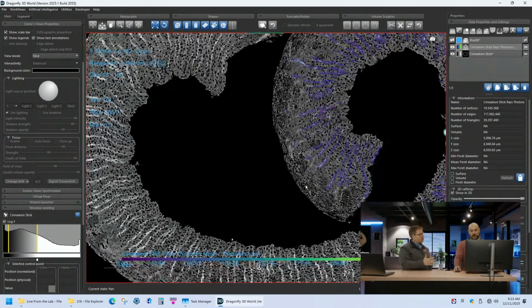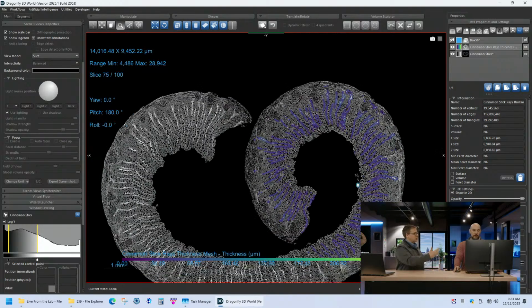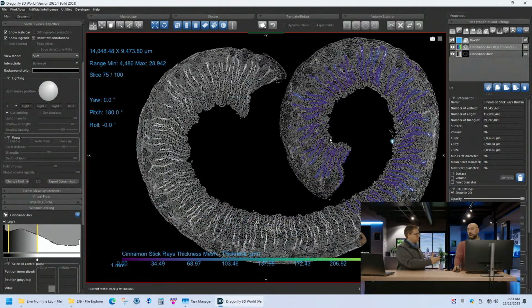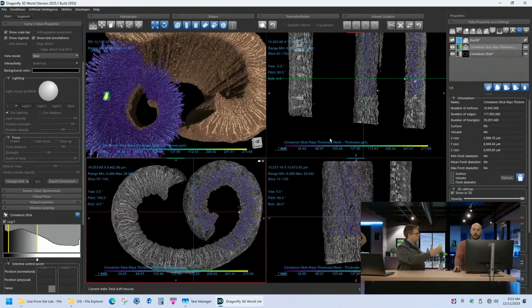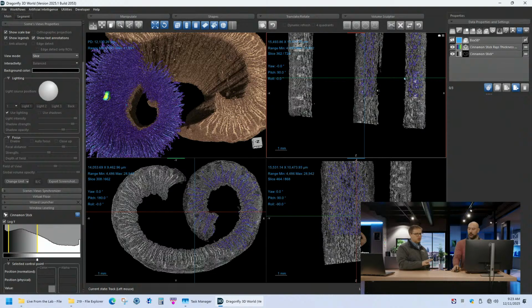So you can see here that that's when you start that discovery, and what the software is doing now is helping us support that with both the qualitative imagery, but also the quantitative. Right. Now, to talk a little more quantitative, though, I think we need a simpler example. Yeah, at least in this short period of time.